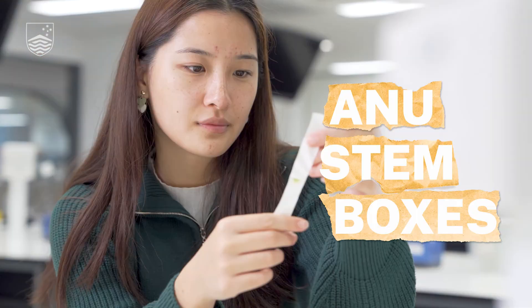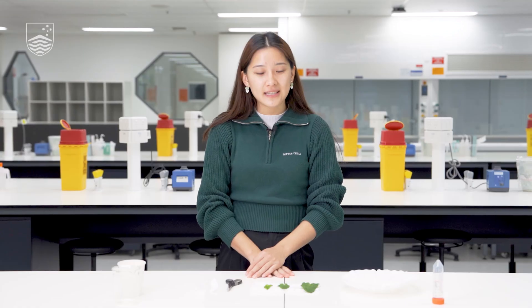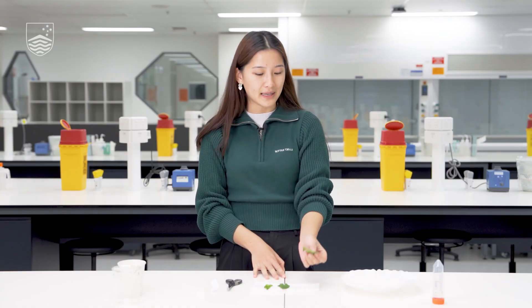Hi everyone, today I'm excited to tell you about what an ordinary spinach leaf can tell you about the wonders of plant science. My name is Rose, I am a first year PhD student at the Research School of Biology here at the ANU. Today I'll be running you through a quick and easy experiment to take a look at the compounds that change the colour of various plants and how we might explore the different properties that they have.